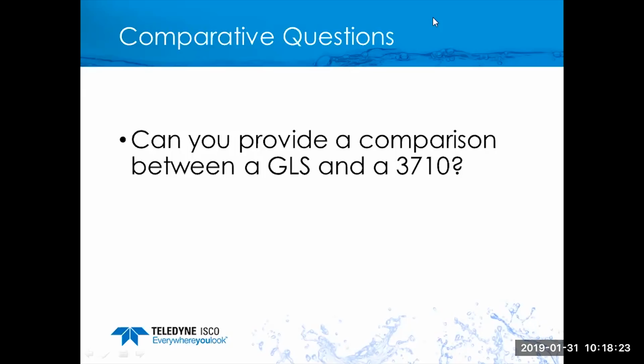The 3710 can use non-uniform time pacing. Non-uniform time pacing can be an advantage in an application where someone who's being monitored, say in industry for instance, may understand when that sampler is going to be used by hearing it go off. So if they hear it every 30 minutes, they can anticipate when it's sampling and try to cheat it by discharging when the unit's not sampling. So with the 3710, we have the ability to set non-uniform time pacing so that the sample routines themselves are not evenly spaced, therefore making it much harder to cheat the system.